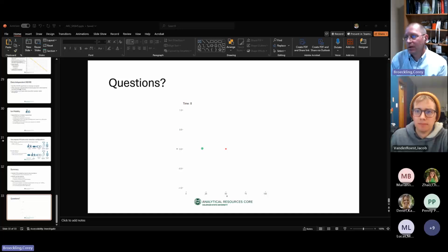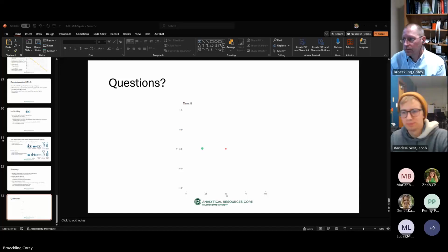But it can be an issue if the library isn't developed in that manner. If your collision energy is at 30 and the only library one is at 10, then the quantitative differences are going to be relatively large in the product ions that are detected. And sometimes you might not get the same ions at all. Oftentimes there's still enough overlap, particularly if you're using accurate mass MSMS, that you can say, well, it looks like it's probably this, but the spectrum match isn't great because the product ions are qualitatively the same, even if the quantitative data isn't exactly the same. Thank you.